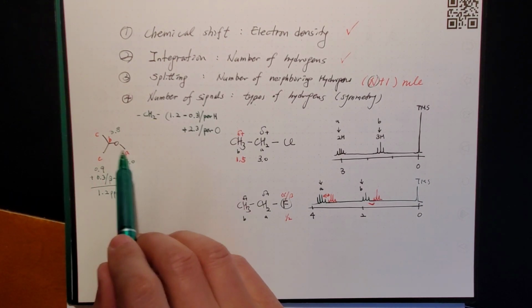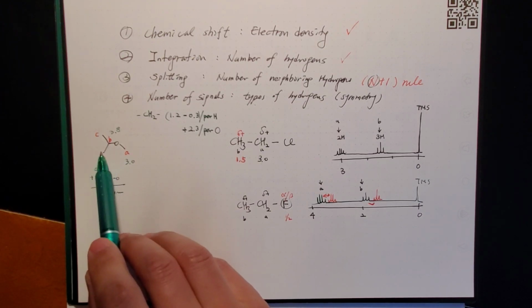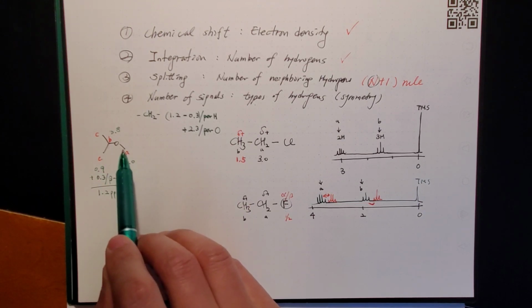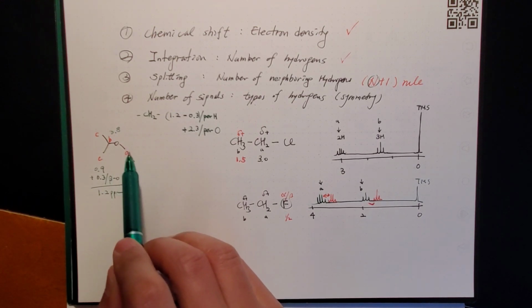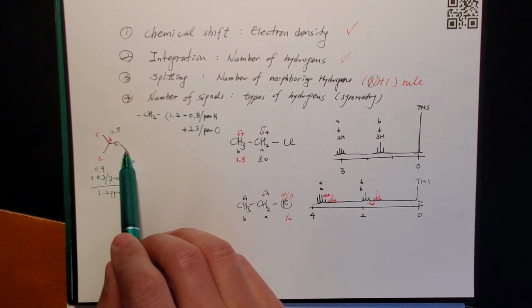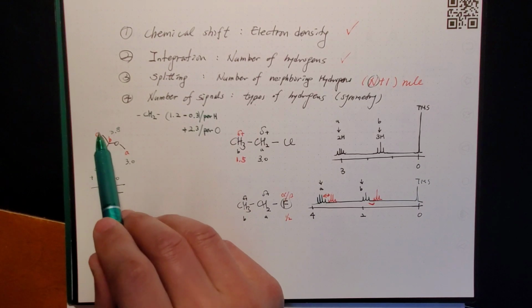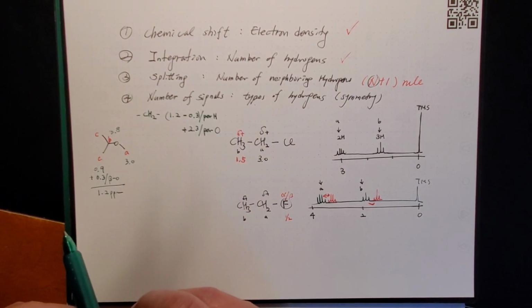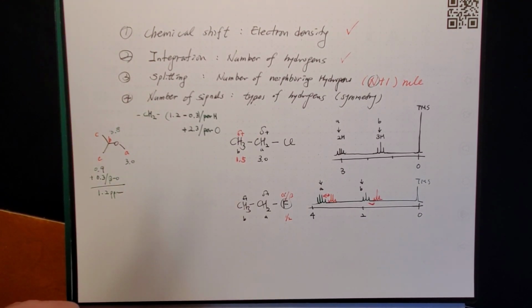If you have to decide which one is more de-shielded, then you decide the carbon with the more carbon rather than more hydrogen, because you have more electrons with the more hydrogens, right? So the carbon with the more hydrogen is getting more electrons. So you can say 3.5-ish, but a little less, a little more. That should be enough for non-majors. And then the beta ones, about half of it. So about 3.5. Half of it is like 1.7, you know, it's not close enough.